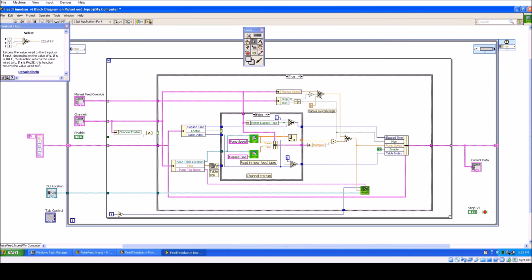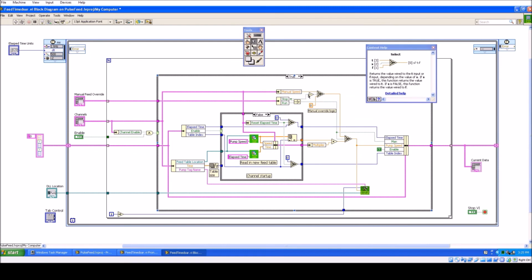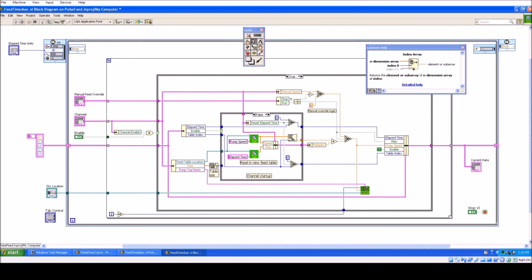Now I will also go through various functional blocks here, and these are graphical representations that come with LabVIEW of various logic functions. Once again, you get these off pull-down menus and you connect them together to do the kind of logic you want. And once again, the context help is really useful because it can show you what the things are, and it gives a short description of the function of the item. Now, LabVIEW also has a pretty nice overall detailed help.